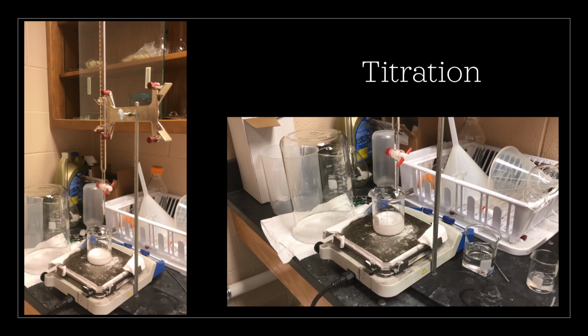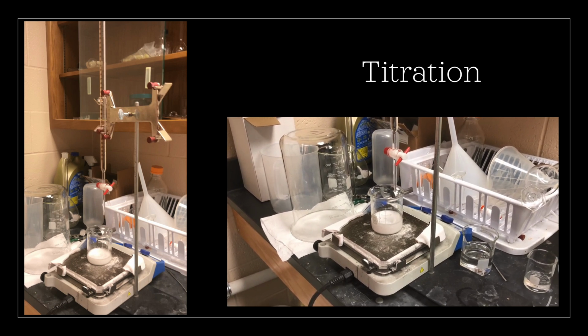Color indicator is added, which turns pink in basic solutions and can be used to identify the point at which the solution is neutralized. Two types of samples must be titrated in this experiment. The first type is to calibrate the concentration measurements recorded by the UOP5 MK2 software, which are based on a system of water and acetic acid.